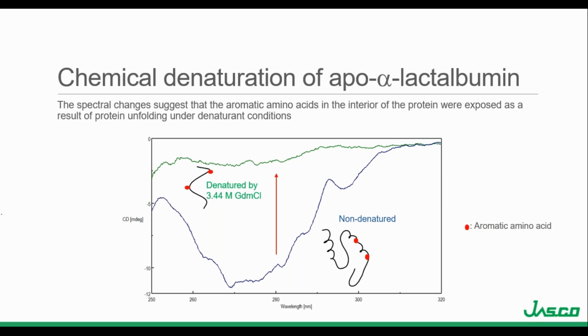And the reduction in the CD signal indicates the aromatic residues are no longer in close proximity to one another and can no longer couple as strongly, decreasing the CD signal.